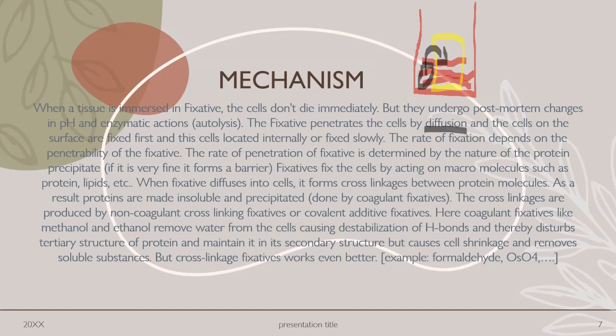Now the rate of fixation depends on the penetrability of the fixative. So if we want to increase the rate of fixation, we need to increase the penetrability of the fixative. The rate of penetration of fixative is determined by the nature of protein precipitate.